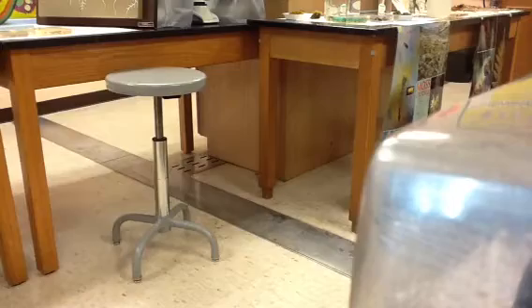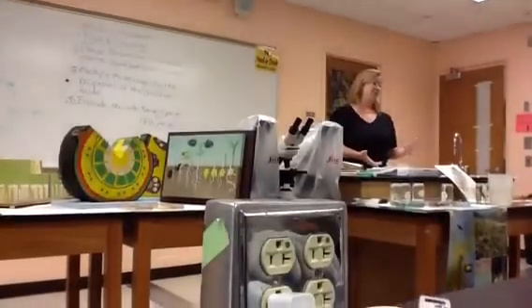Plastic containers. So you don't actually get to do Lab 10 today, because we don't have Petri dishes for you to put your stuff into. But we're still going to talk about it. It's called dry labbing. We're going to walk through it as if we were doing it, and talk about the results that you're going to get, because I don't want you to mix the material, so you don't actually get to do it today.